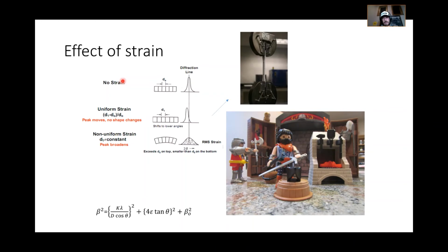Theta here is just your peak center divided by 2, because we're getting 2 theta, right? K is some constant, and we'll see later on that K is generally arbitrary. It's generally 0.9. Lambda is your wavelength, and D would be your crystallite size or your grain size. So there's ways to calculate strain based on diffractometry data.